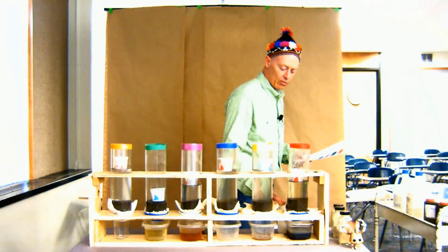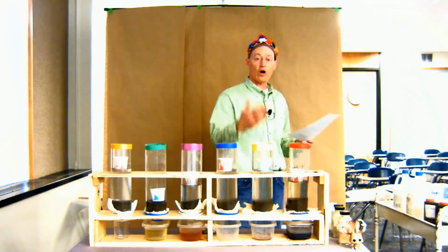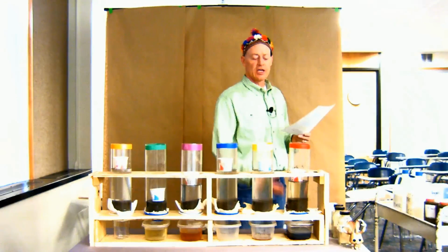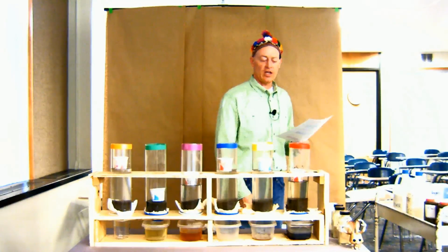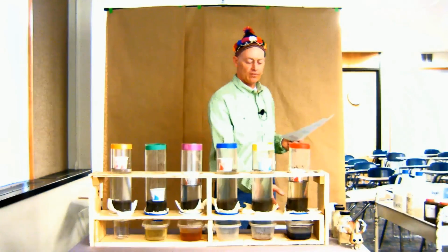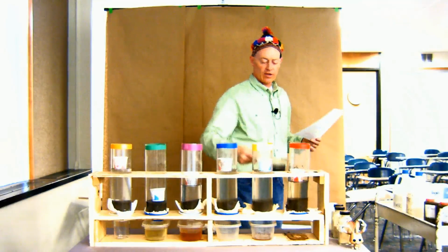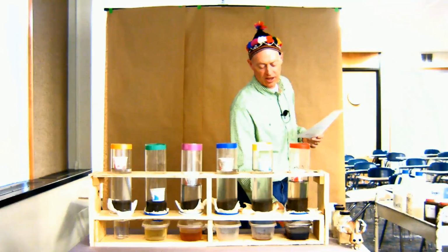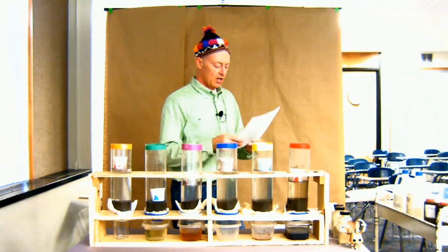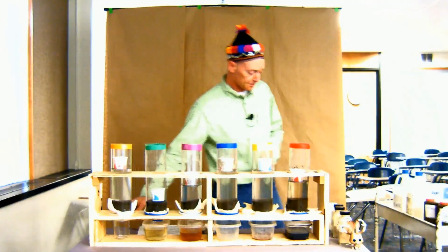And remember, we moved water through sodium chloride through this soil. We put sodium on the exchange sites. We've now reduced the electrical conductivity, and this water has basically stopped moving. So we created a Sodic soil. We dispersed the organic matter that was in that soil. That's the black stuff that we see there. I will flocculate that, and by the time we meet again, that should have settled. And it does take some time. It's not instantaneous. Okay.